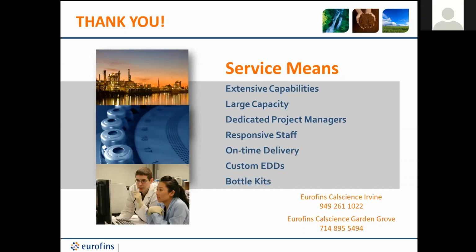I have a follow-up question. This is Aaron, concerning composite sampling. For the composite sample, you have to get sample kits from several different locations, and my understanding is the lab puts them into that giant beaker unit that they mix it all together for the aliquots to be equal to get a representative sample. How do you do that with oil and grease if you're not supposed to use a secondary container?